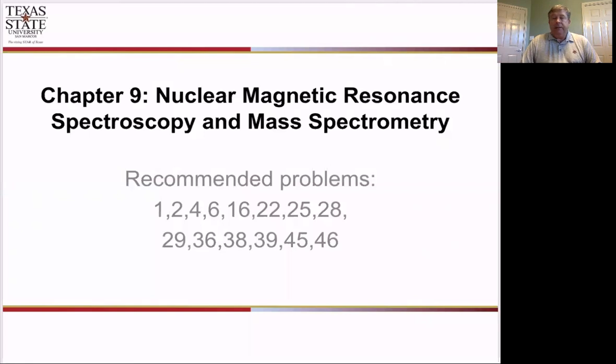Okay, Bobcats, this is Organic Chemistry 2341, Chapter 9, the last section, which is mass spectrometry.